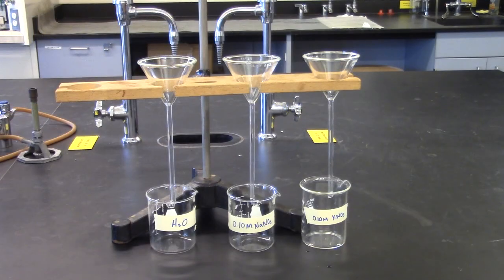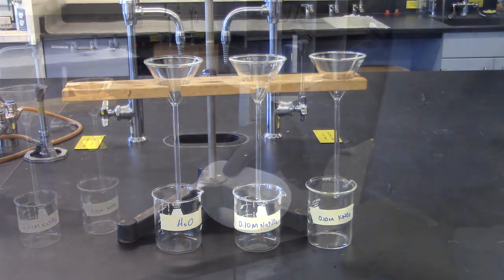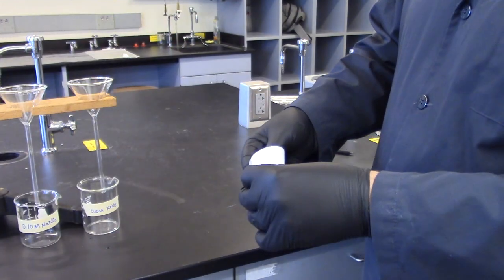While the excess potassium acid tartrate settles to the bottom of the flask, we will set up three funnels for filtration, collecting the filtrate into labeled beakers. Fold filter paper to put in funnel.